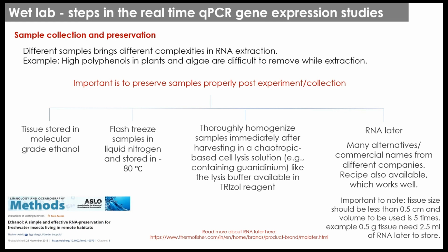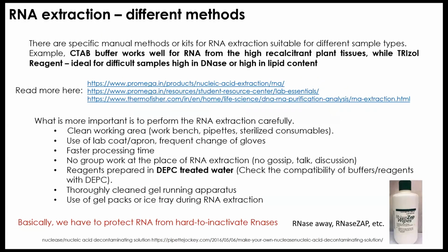You generally have to keep the RNA later preserved sample at room temperature for a day. After that, if you want to keep it for the short term, let's say one week, you can keep it in the fridge. If you would like to keep it for a longer duration, then after a day of incubation at room temperature, you should bring it to -20 and store it for a few months. I hope it is now clear that sample preservation is a very important step when you do the RNA extraction.